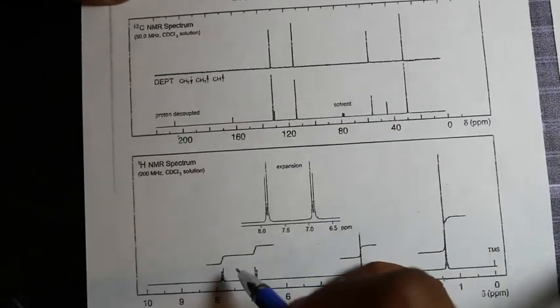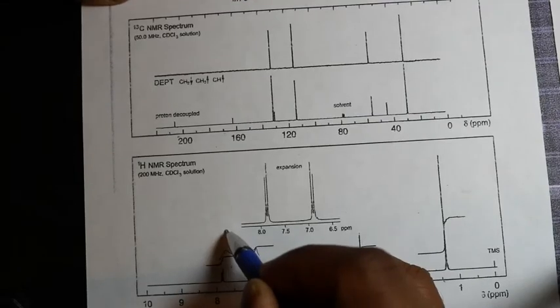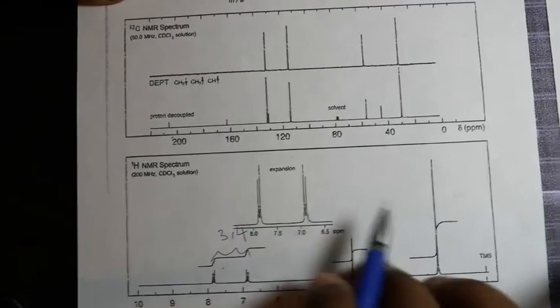So here, these 2 peaks belong to 3 and 4.